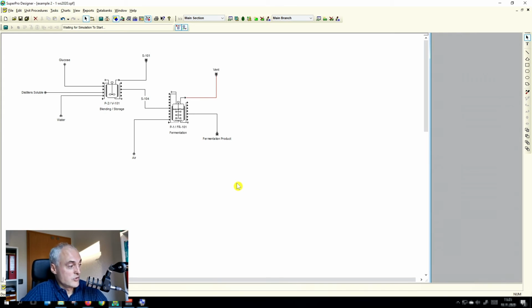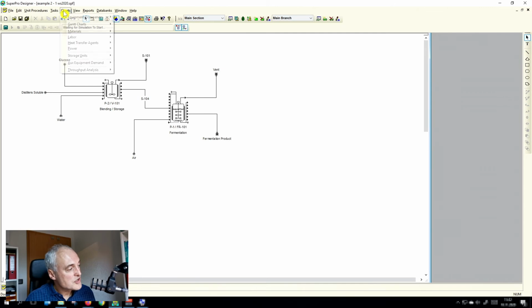It looks like everything is fine. However, to be honest, this was just luck that everything was cool, because we have just initialized, but we didn't take care of any scheduling issues. Let's see where we find this scheduling. So we display on charts the operations Gantt chart.